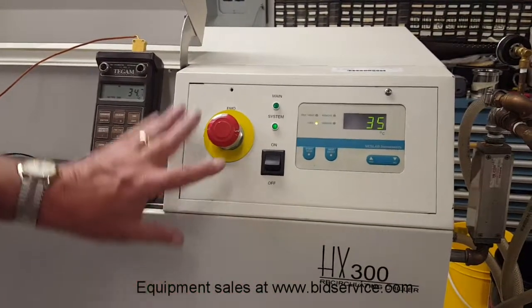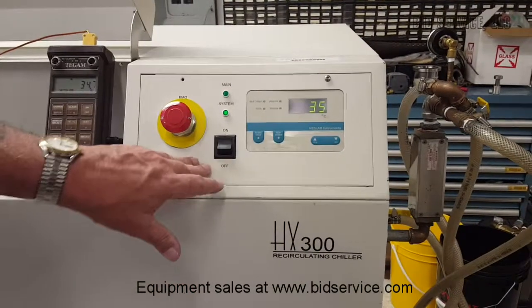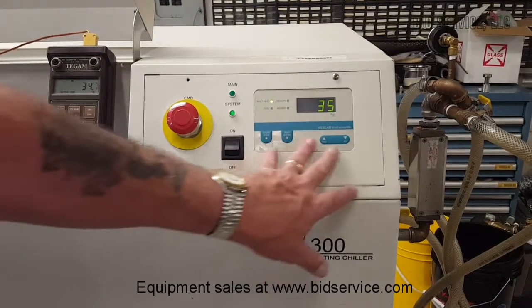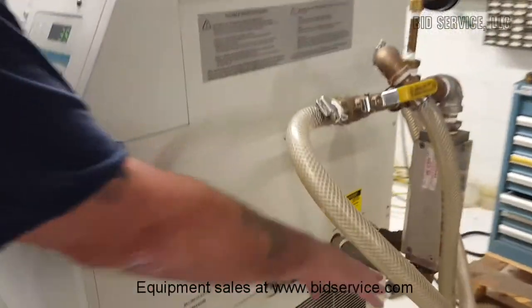On your control panel here you have your emergency shut off and your main on and off. There is a breaker in the back for the circuit breaker for the three phase input and your control panel is here. On the right hand side is your input and output for your water for the chiller.